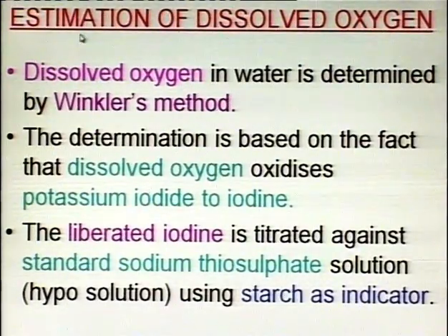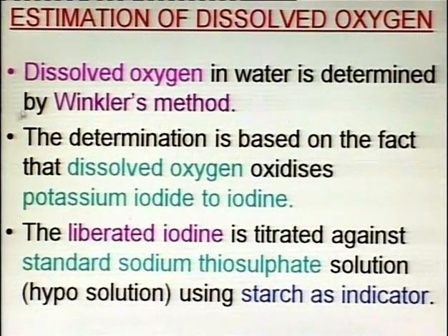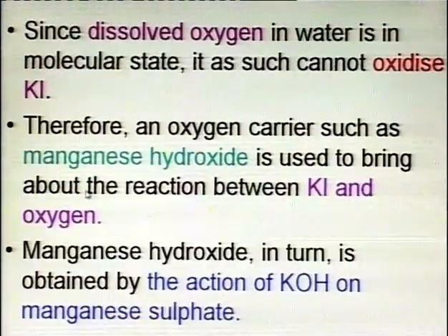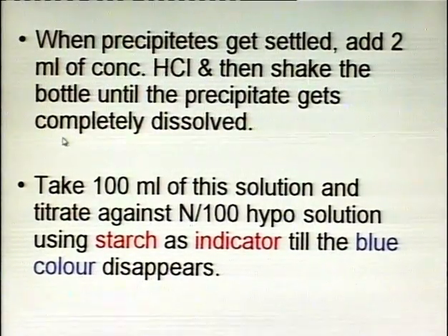The last estimation is estimation of dissolved oxygen. Dissolved oxygen is determined by Winkler's method. In this method, so this is all about the estimation of oxygen.